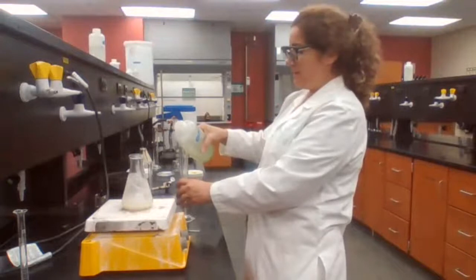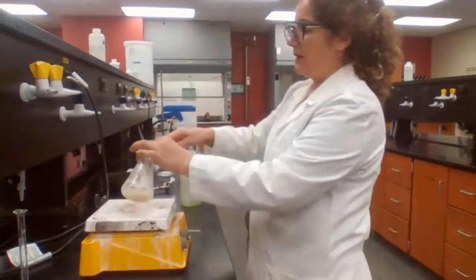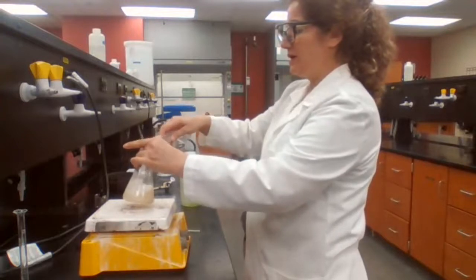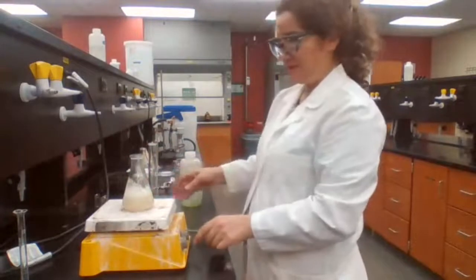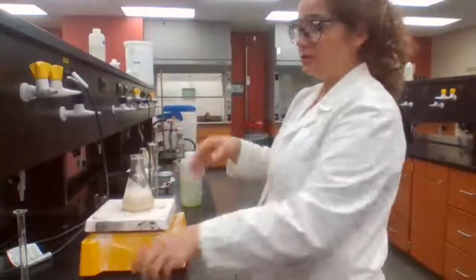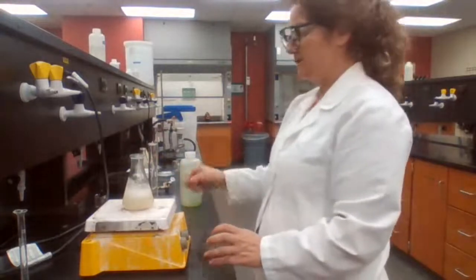Let it boil. Heat up to boiling. I usually warn the students in this step: when the solution reaches the boiling point, if you don't stop it right away, it's going to foam out and you lose the chemical. So as soon as you see a clear solution, you should stop boiling.